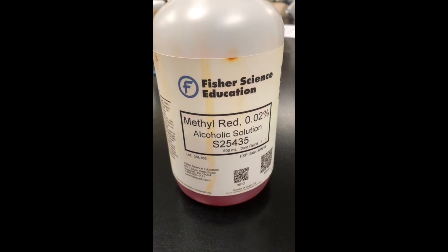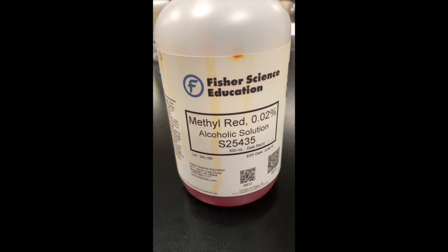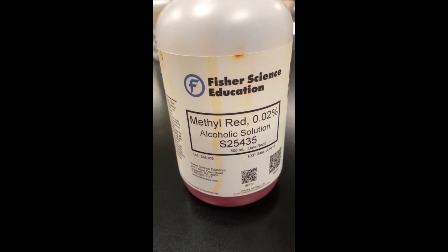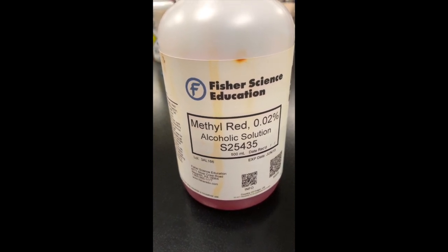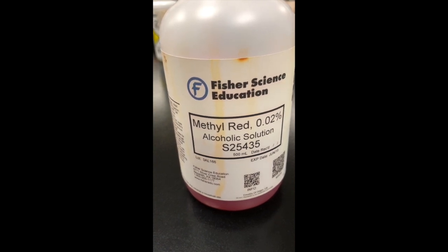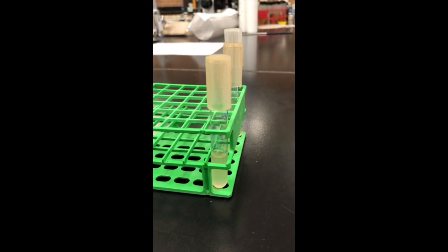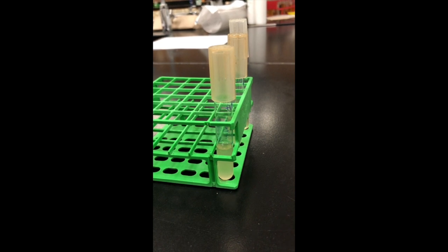We're going to do the methyl red test. The methyl red test shows if our organisms can undergo fermentation processes that change the pH enough that we get a bright red color in our media. Now this drops the pH quite a bit, so there should be a lot of acid in the tube. So let's see what happens when we add our methyl red to our bacterial tubes.